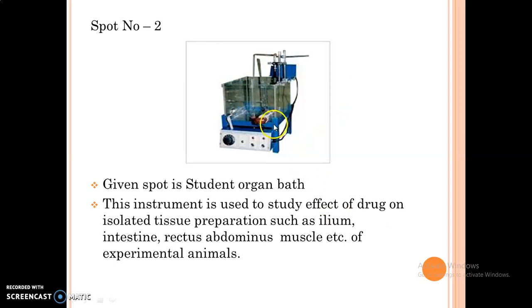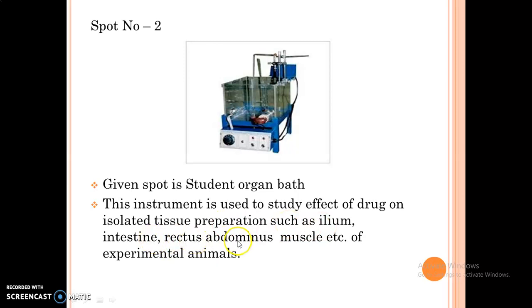The next spot is student organ bath. This instrument is used to study the effect of drugs on isolated tissue preparations such as ileum, intestine, rectus abdominis muscle, etc. of experimental animals.